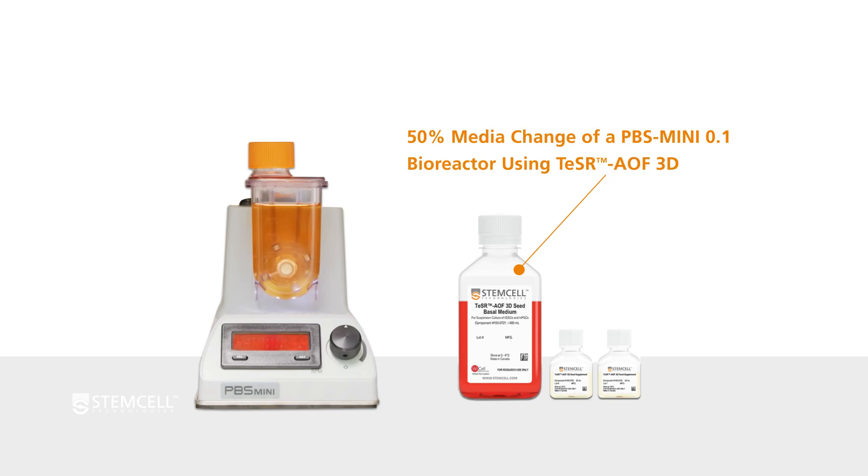We will demonstrate how to perform a 50% media change of a PBS Mini 100ml culture of HPSC aggregates in 3D suspension using TeSR AOF 3D. A 50% media change is to be performed on day 3 of a 4-day culture.